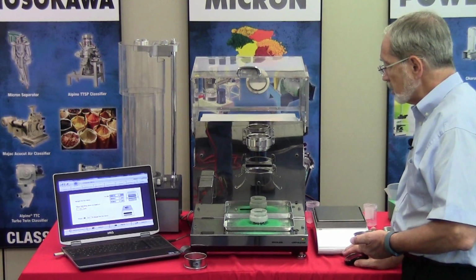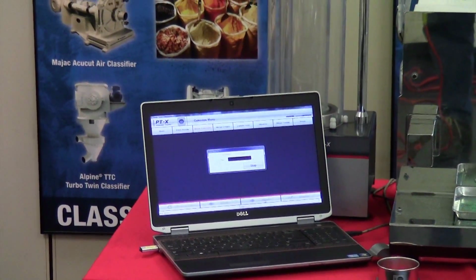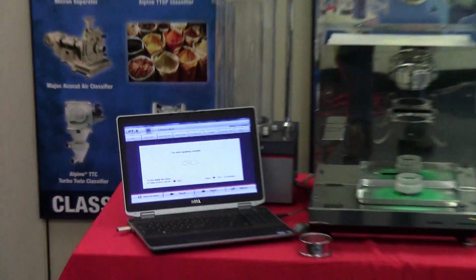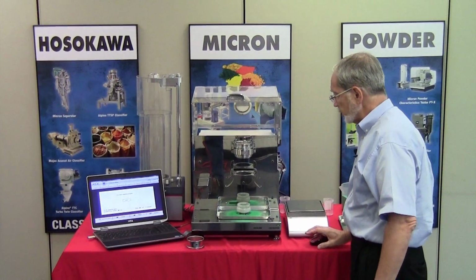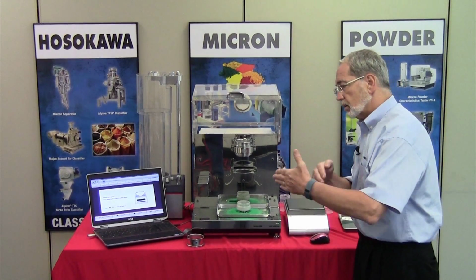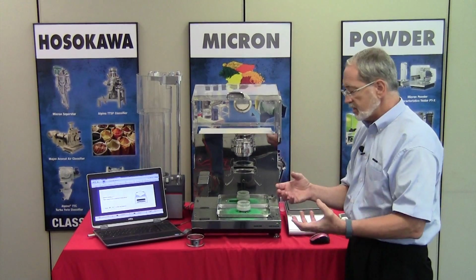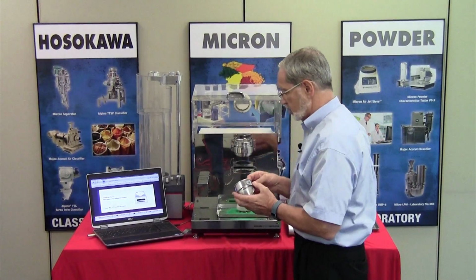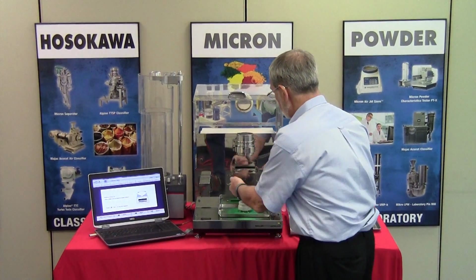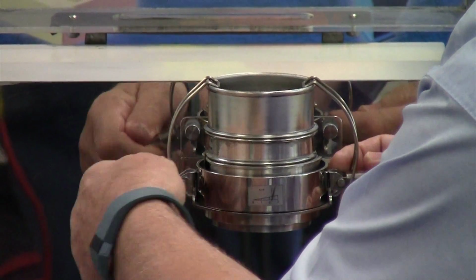Pressing next, we now take the top screen, place it on the balance, it stabilizes, and notice the weights have all varied to some degree. We now put that in place. So we press the next button. Once again, when we move along further in the software, it's going to give you a better pictorial as to how to assemble it. But I like securing things because otherwise you move along and you're not secure, and the software seems to leave you in the lurch and doesn't give you that guidance.